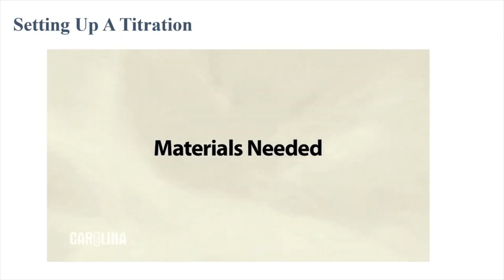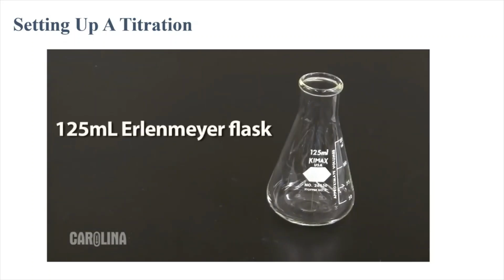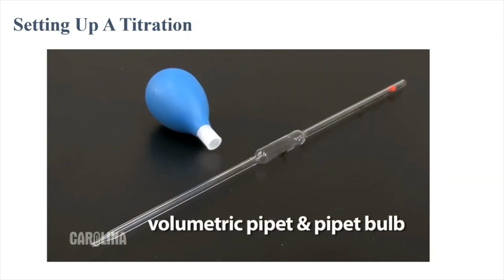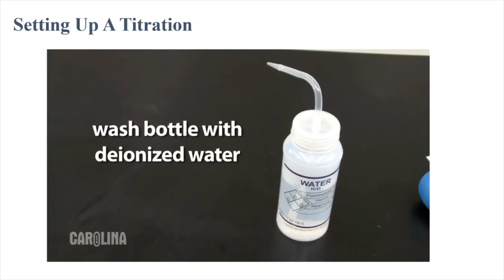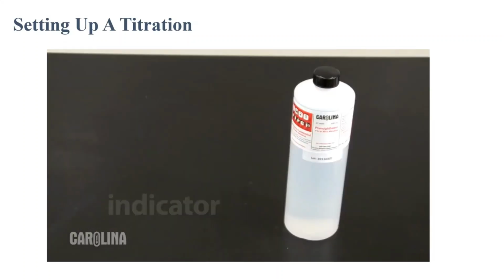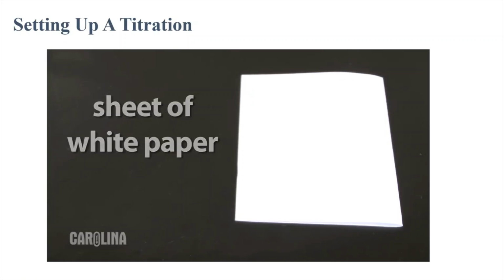Other materials you will also need include a small funnel to help you fill the burette, and a 125 milliliter Erlenmeyer flask, which works best for titrations. The shape of the flask allows for more vigorous swirling than a beaker or other glassware and minimizes spill hazards. You also need a volumetric pipette and pipette bulb to transfer a known volume of analyte to the flask, a wash bottle filled with deionized water, a beaker or flask of titrant and of analyte, indicator selected for your reaction, a reading card to help read the meniscus, and a sheet of white paper to help visualize the endpoint.